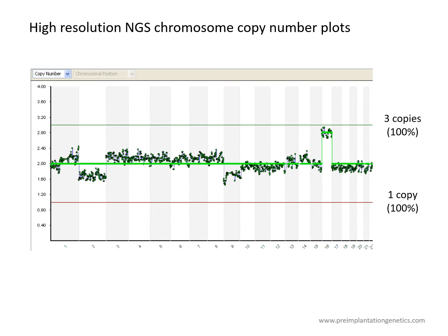This is an example of a high-resolution NGS-based chromosome copy number plot. The advantage of NGS-based methods over previous methods like array comparative genomic hybridization are that the changes in mapped reads are linearly related to the number of chromosomes in the sample DNA, subject, of course, to whole genome amplification bias and other factors, including software smoothing of the variation between different bins across each chromosome and so on.